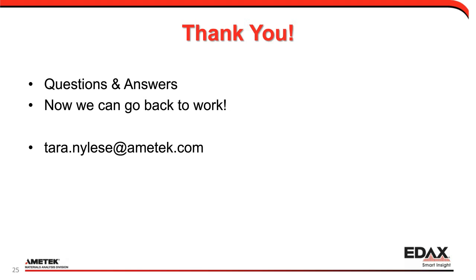We've got your email address, and we could start some communications about the APEX software. And that will streamline your analysis. APEX is geared towards entry-level users, people just starting out in EDS and microscopy and microanalysis. So certainly, let's set up a time to discuss APEX.